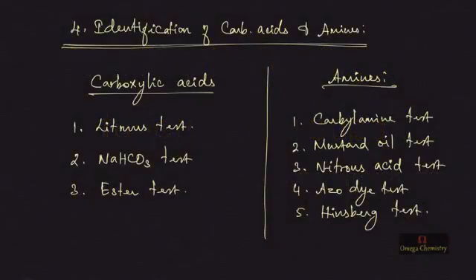Hello students, welcome. As a continuation to learn about the identification of organic functional groups, we shall learn about amines and carboxylic acids identification in this session, right? So we are going to look at carboxylic acids first.